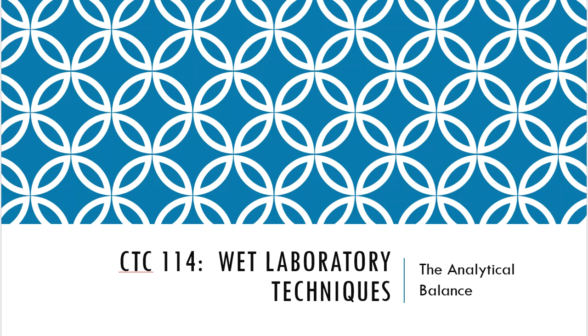Welcome to CTC 114, Wet Laboratory Techniques. And in this lecture, we're going to learn about the analytical balance. Yeah, I know, this is pretty simple, straightforward stuff, especially if you've had a science course before, right?